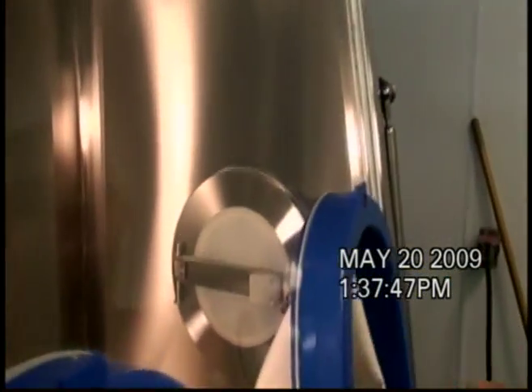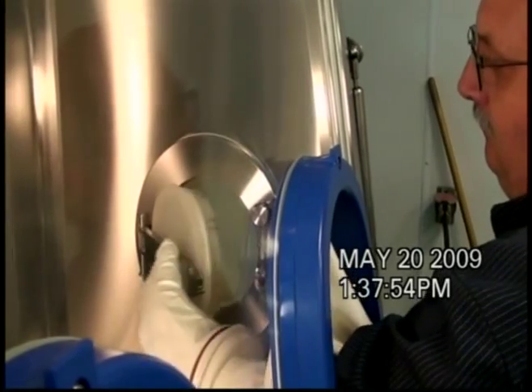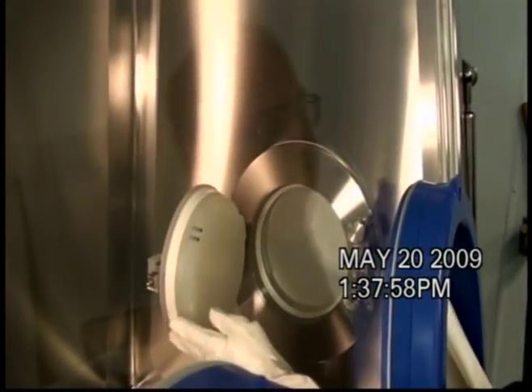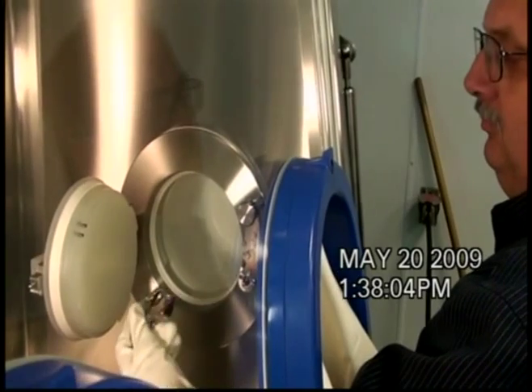Then, using the glove port, the double door that has been created can now be opened inside the isolator. You can see the gasket sandwiching and sealing the two doors together, and the other gasket sealing the container against the outside of the isolator.